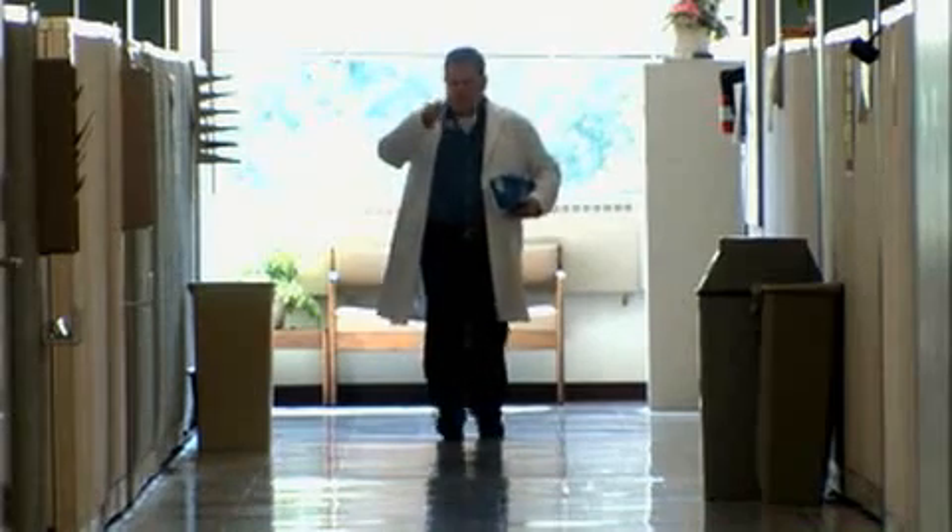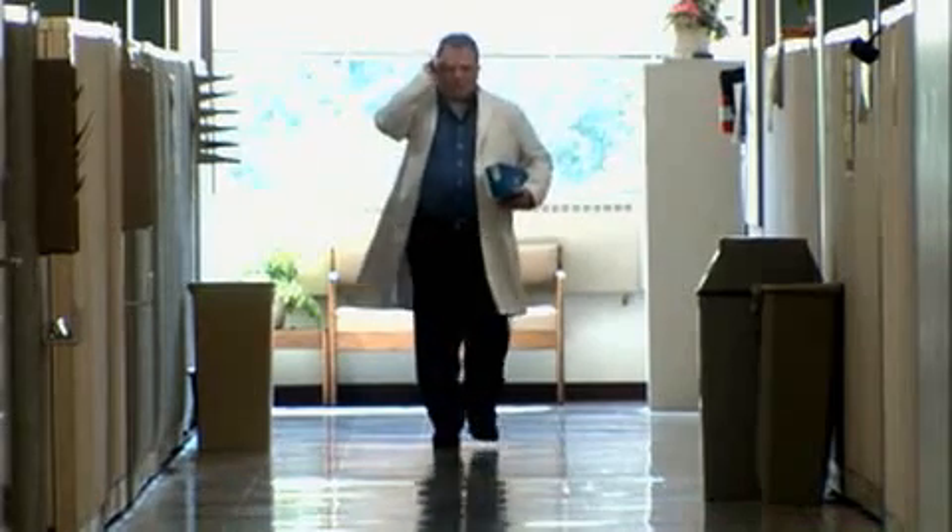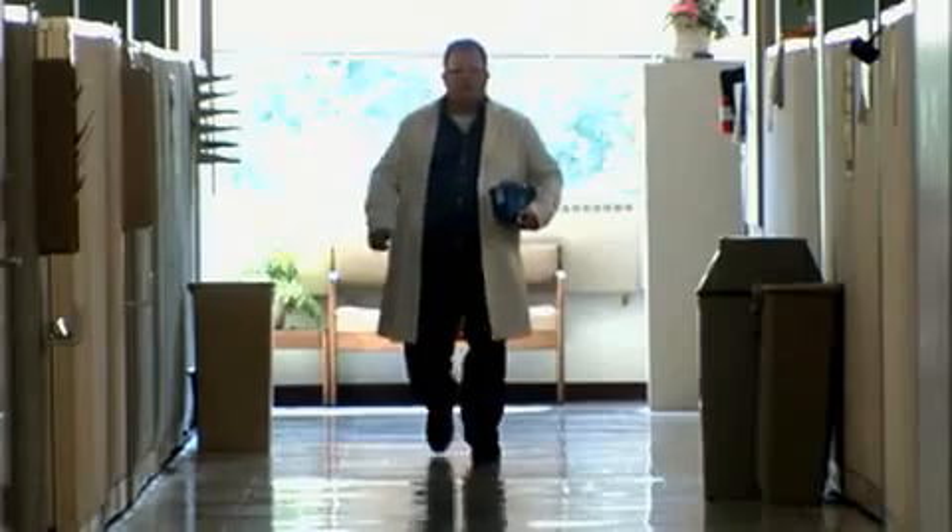And here comes the great hope, fresh out of the PhD program. You know, Bob, they say up at State this guy did over 5,000 RNA isolations during the course of his graduate work. He's just a real performer. Looks like he's carrying that new kit from Agilent.